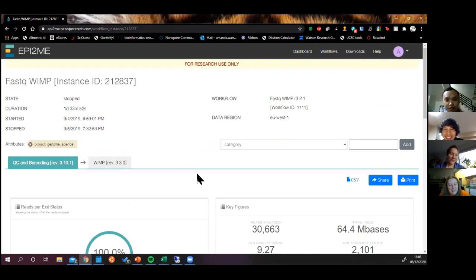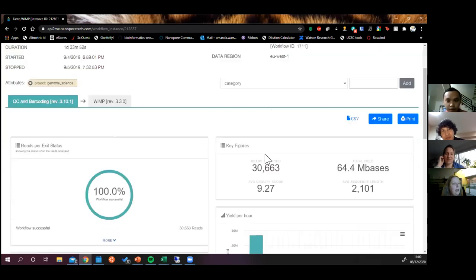Okay, cool. Basically, this was at a conference. I was doing a live sequencing demo. So people were having their conference dinner while this was up on the screen, and they were trying to guess what the sample was. As your sequencer is running, I believe they're going to build this into MinKNOW very soon, maybe in the next release. But currently what you have to do is tell Epi2ME where the files are going to, and it uploads them in real time and does the analysis remotely.